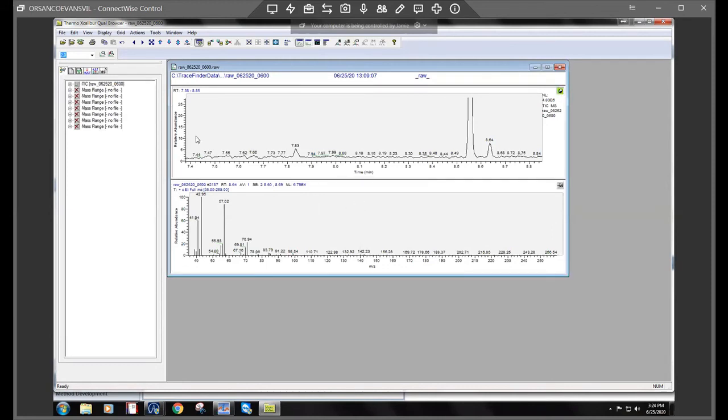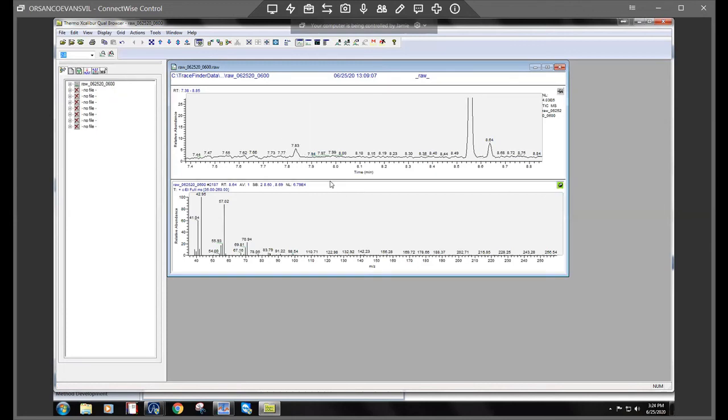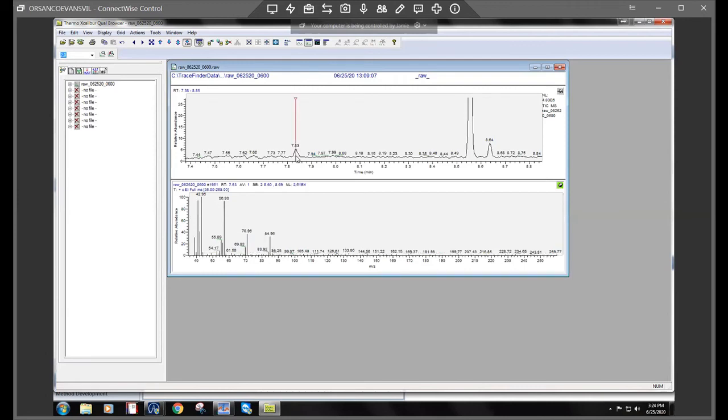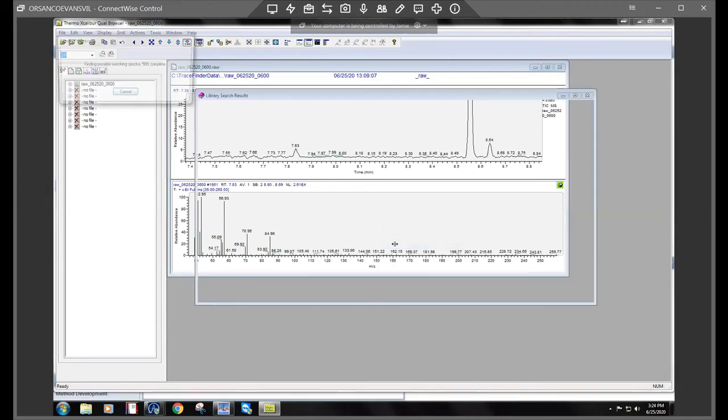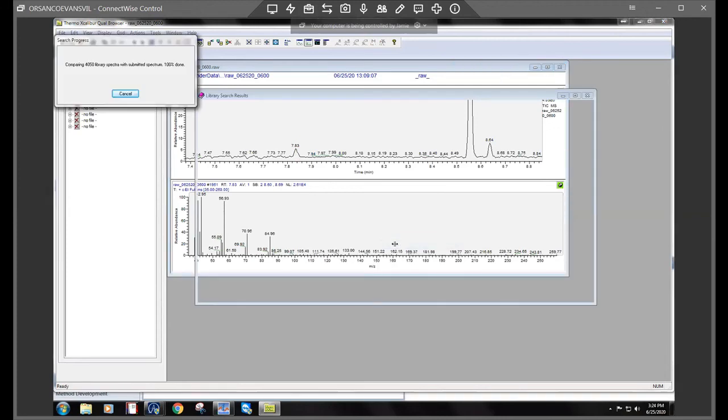I believe these compounds are just kind of garbage peaks that can kind of come off maybe from a dirty column. So I wouldn't worry too much, but at least you can go through the steps to identify if it was something of worry. So we'll do this little one as well.